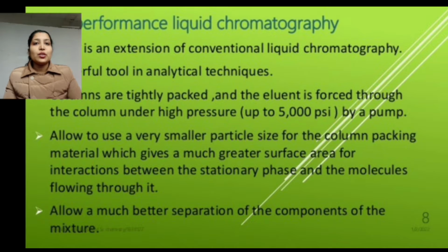So students, today we will discuss HPLC. HPLC stands for High Performance Liquid Chromatography. It is a special form of column chromatography generally used in biochemistry and analysis to separate, identify, and quantify the active compounds.